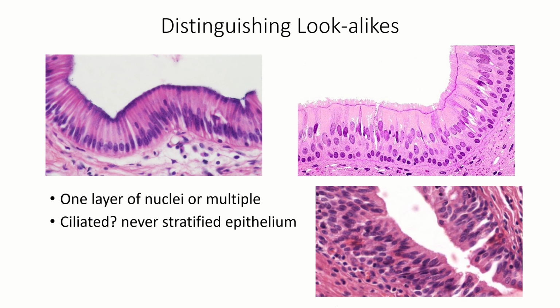What we're working on here is training your brain to learn how to learn what these look like, okay? You're not going to get it right away. You have to look at lots and lots of samples. And in another video, I'm going to show you some strategies for how to do that. But you've got to practice looking at things and then break down, what am I looking at?